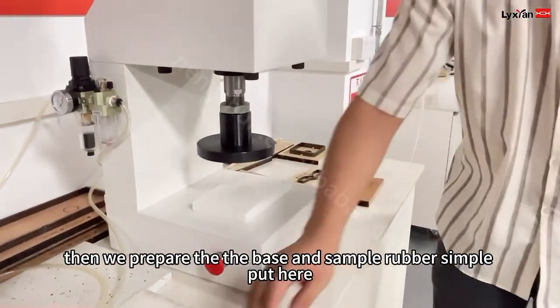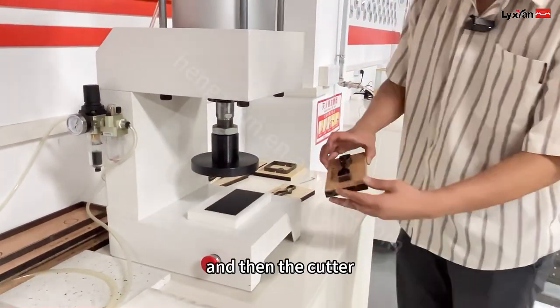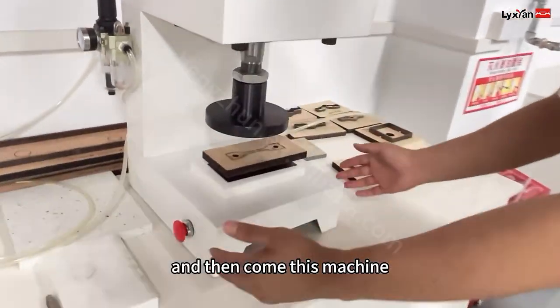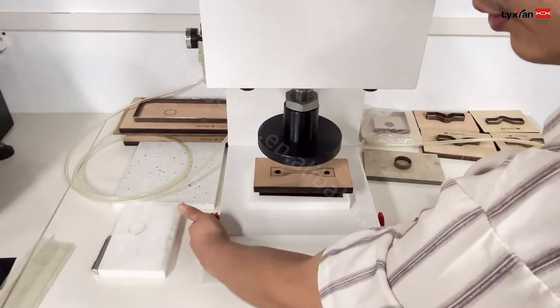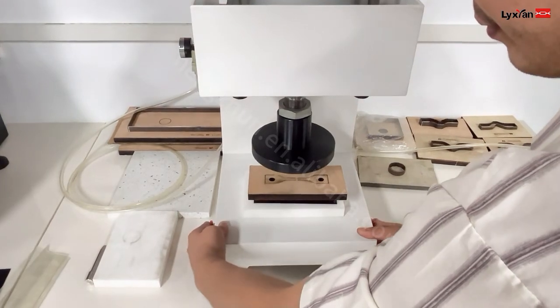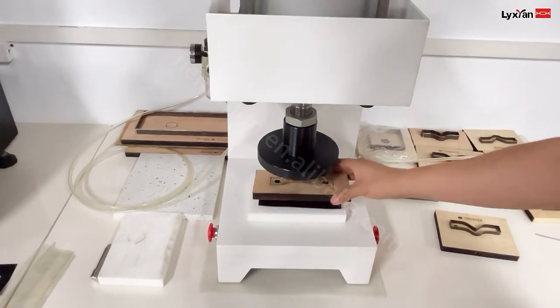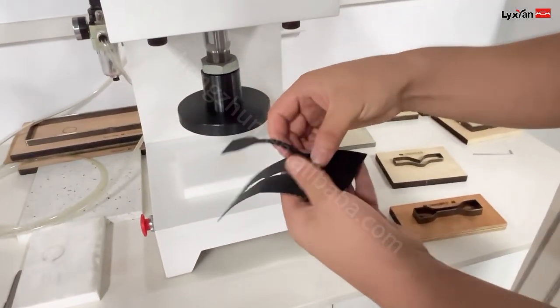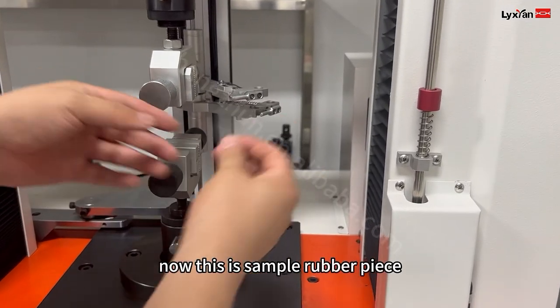Now we prepare the base and the sample — a rubber sample. Put it here. And then the cutter. This machine we need to press both sides together for the machine to work. If we press one side, it's working, so we press both together. Now sample making is finished. This is the sample — a rubber piece.